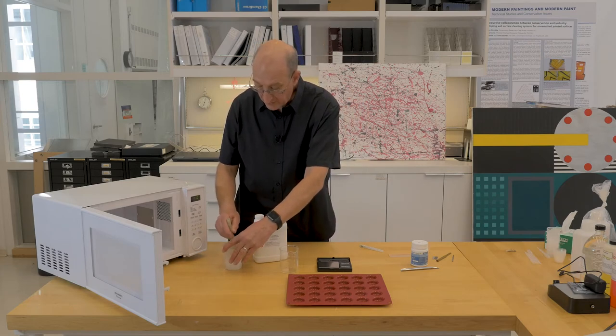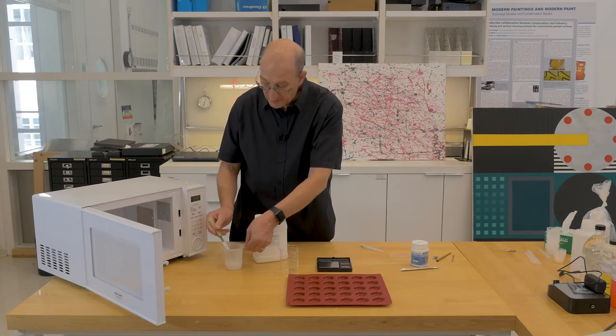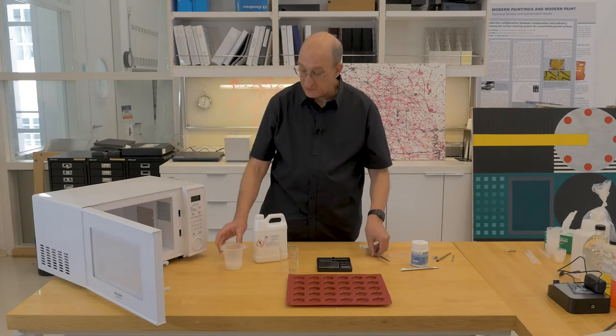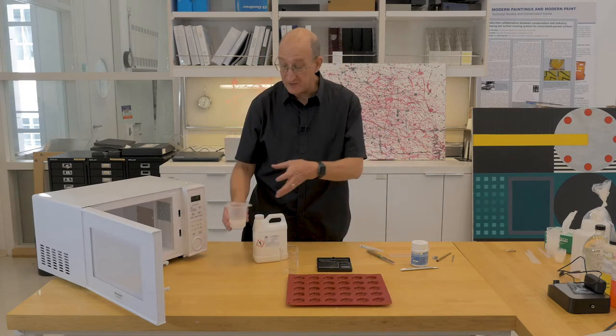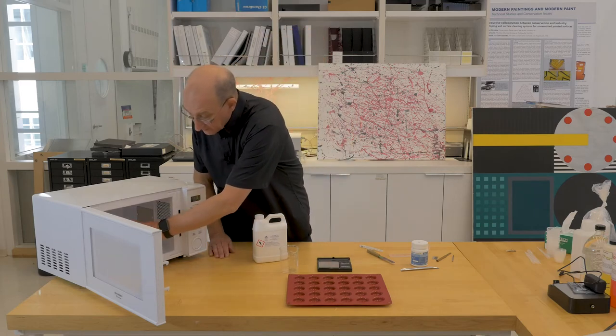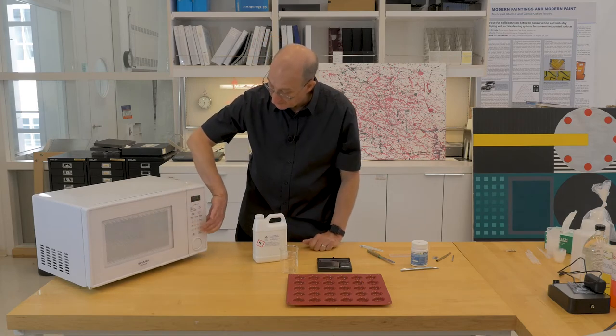It's getting quite warm, thickening very nicely. When it boils, it tends to foam up like a soufflé — it can come up to that height. So you always want to use a plastic container that is well above the height of the liquid that you're heating. Another 10 seconds.